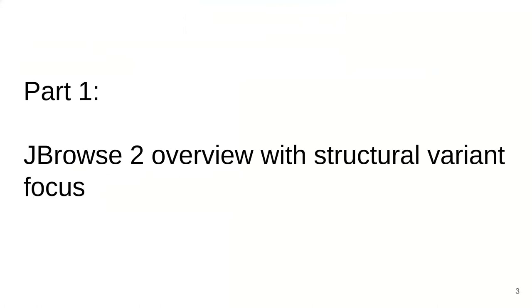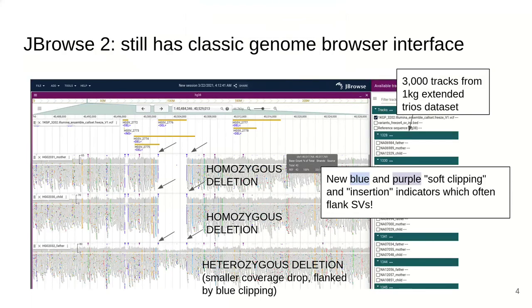I'm going to present an overview of JBrowse2 with a focus on structural variant features. JBrowse2 still has a classic genome browser interface available. You can see here that we're looking at 1000 Genomes data showing a deletion structural variant from a trio with a mother, child, and father.